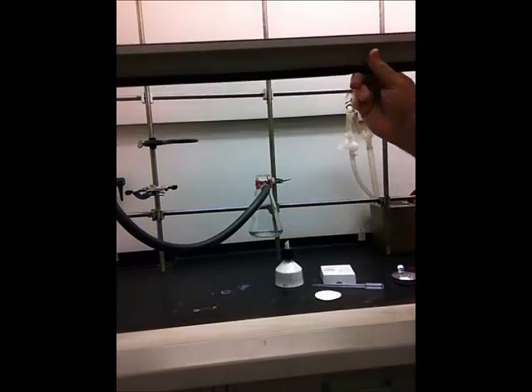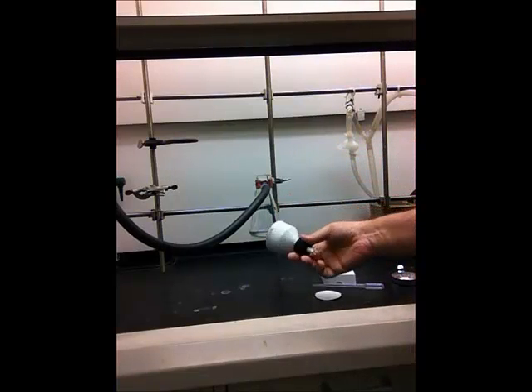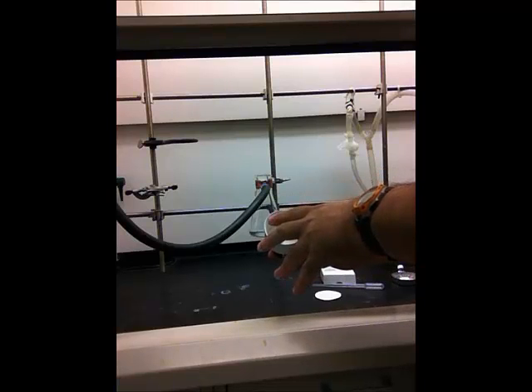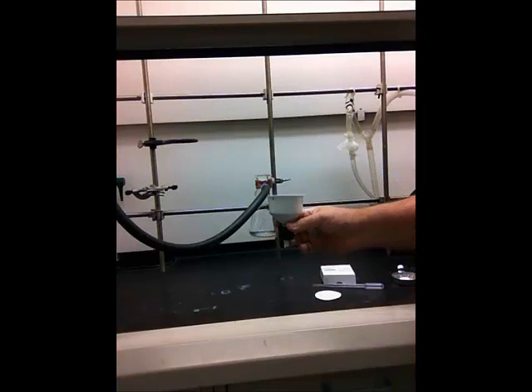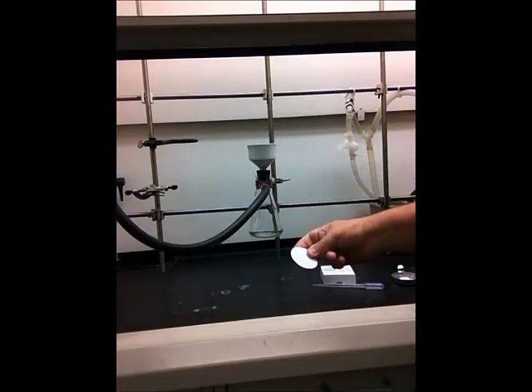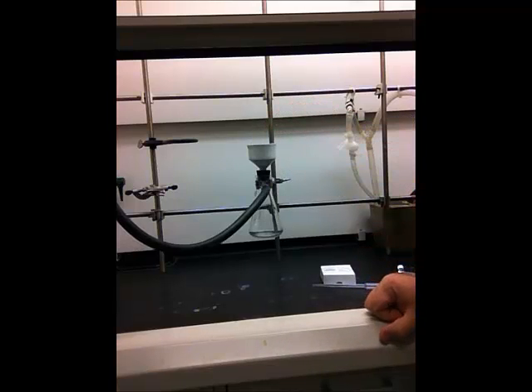Once your apparatus is clamped up and tight, keep the vacuum off. Go ahead and take the Buchner funnel — make sure it's clean; if needed, rinse it out with acetone or water and use a paper towel to clean it up. Then fit it onto the filter flask and drop in your piece of filter paper.